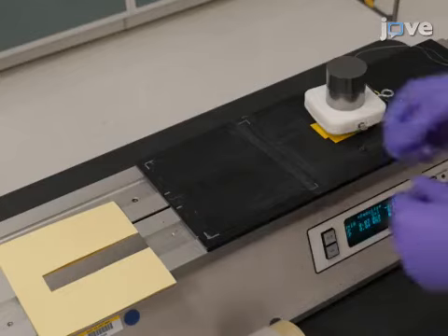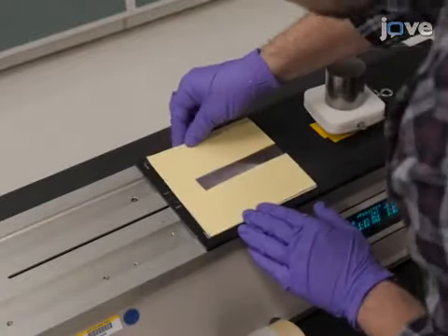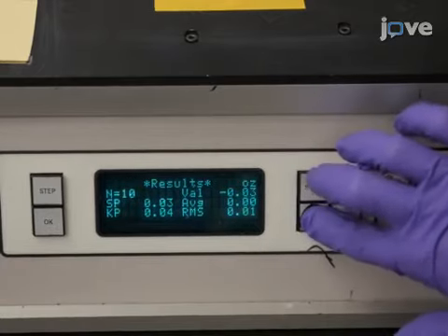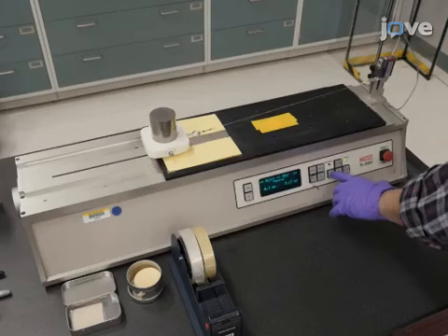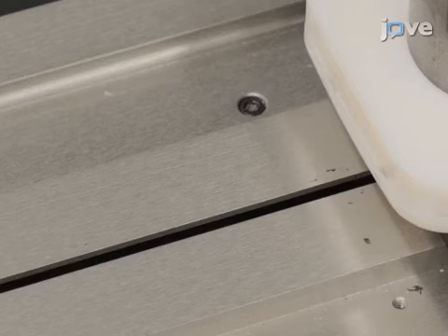And then, adhere the surface to the plane using double stick tape. Now, program the instrument software control with the travel distance and travel speed. Then, initiate the movement of the plane. Check if the wipe follows the sampling path for the entire travel distance.